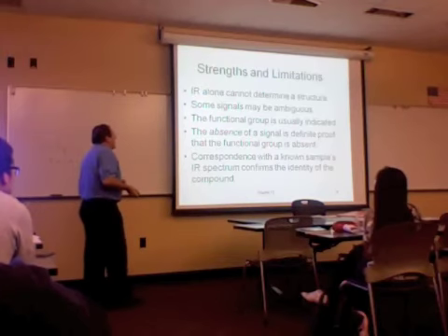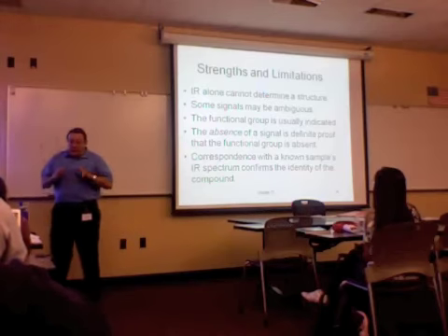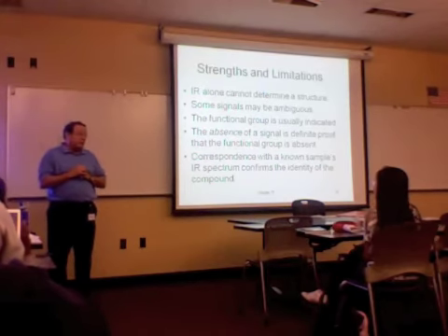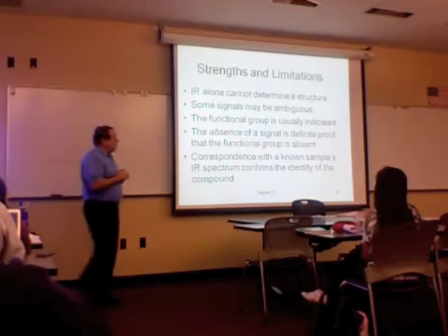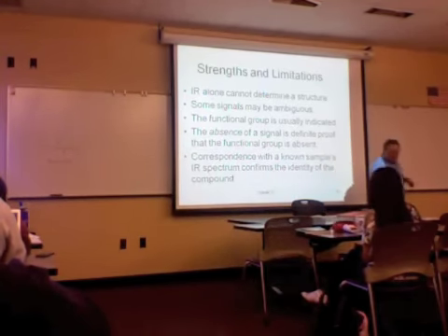All right? Again, in the end, once I think I've identified my compound, I compare the spectra side by side, particularly in the fingerprint region. And that's really kind of how infrared is used in modern qualitative analysis.